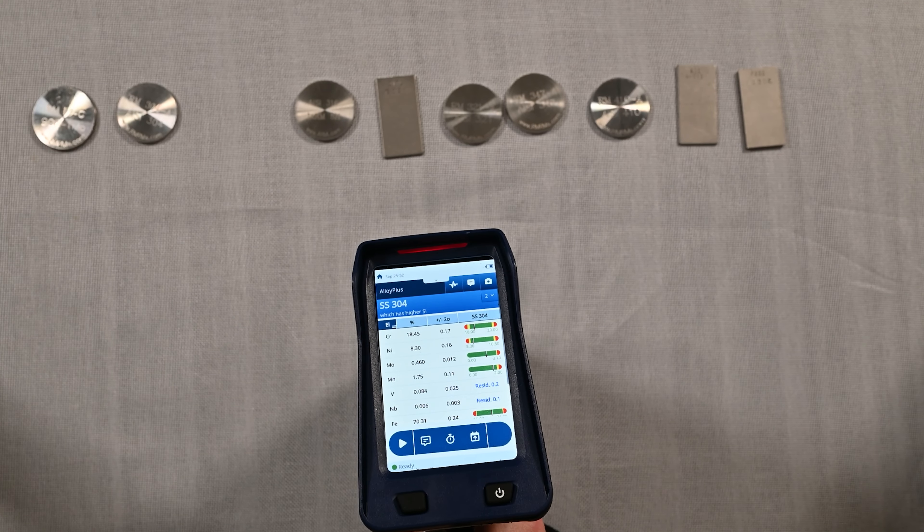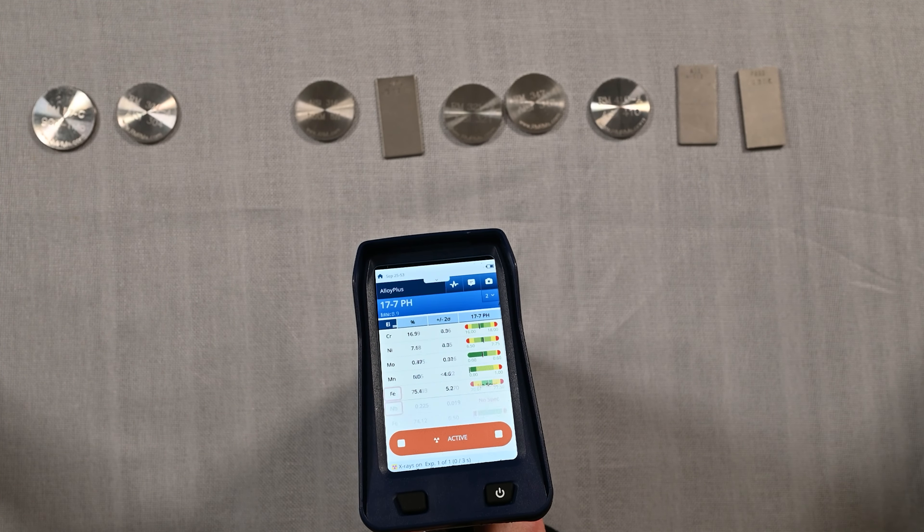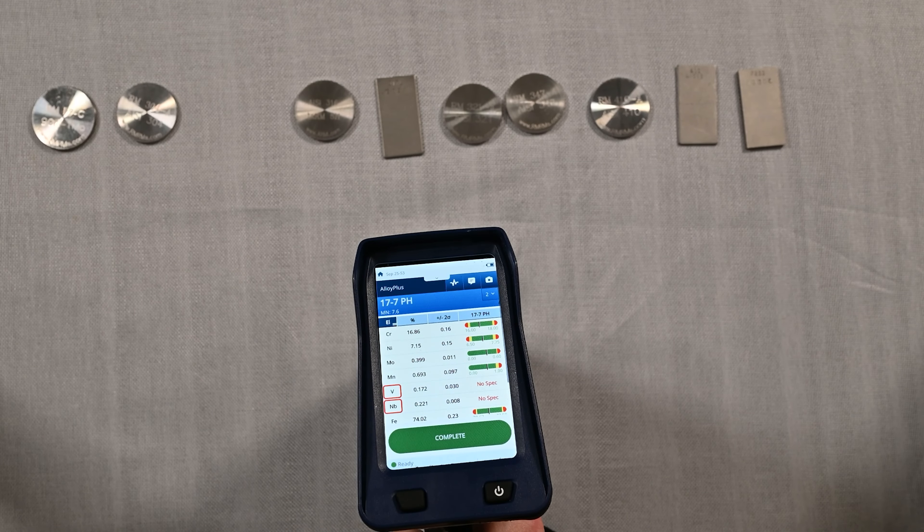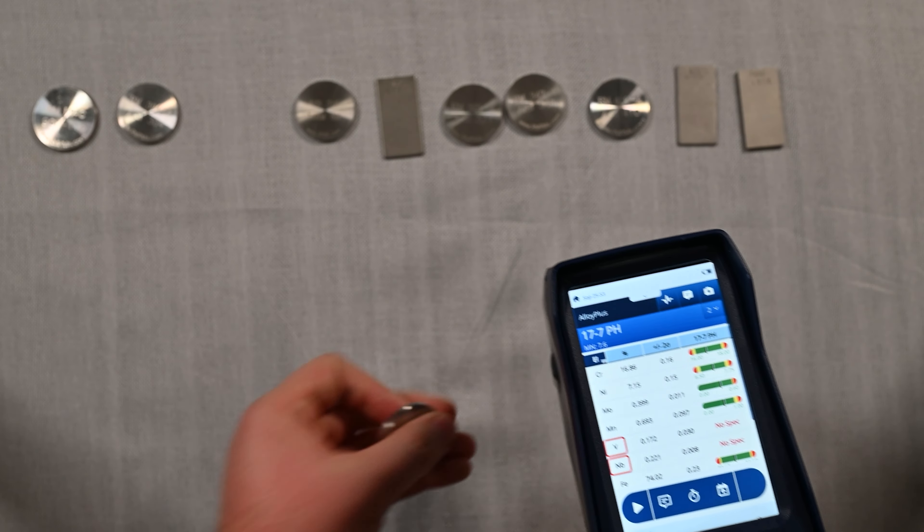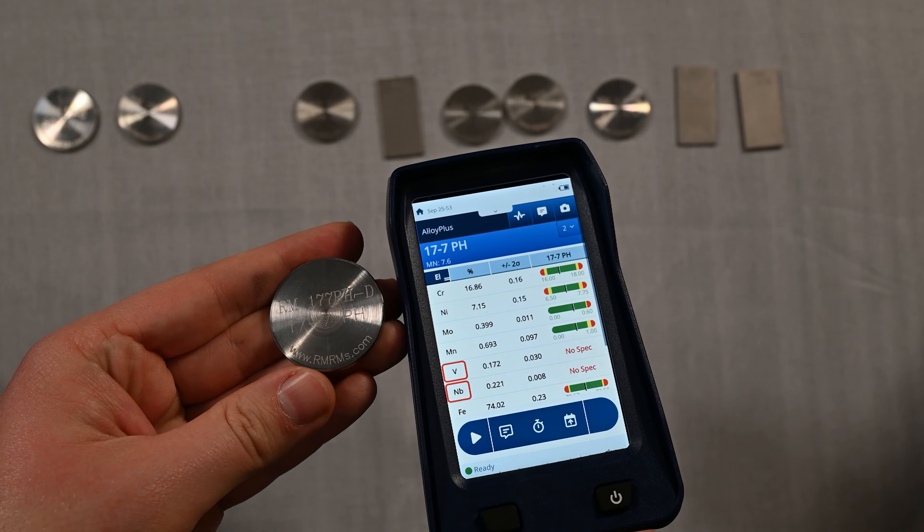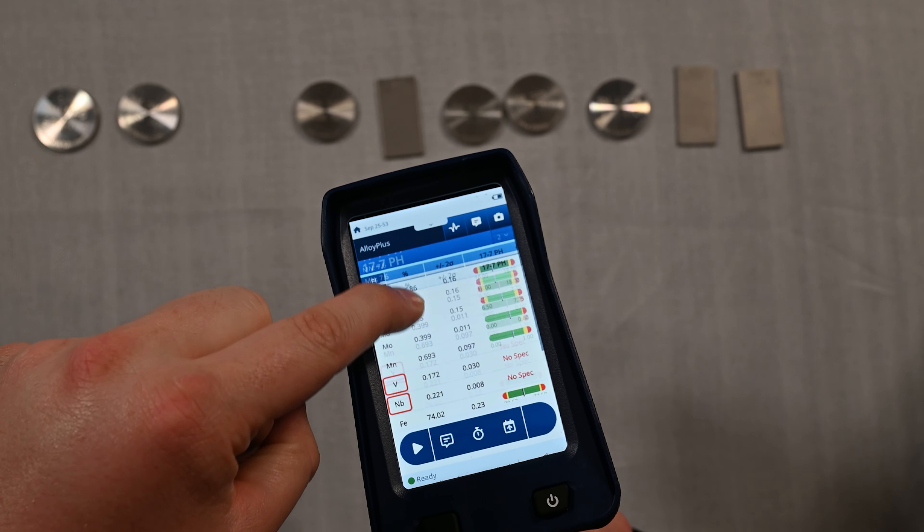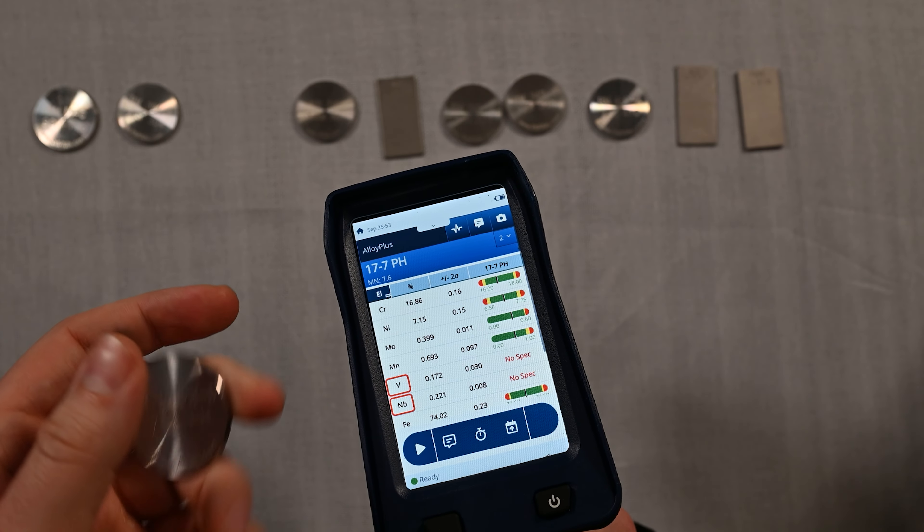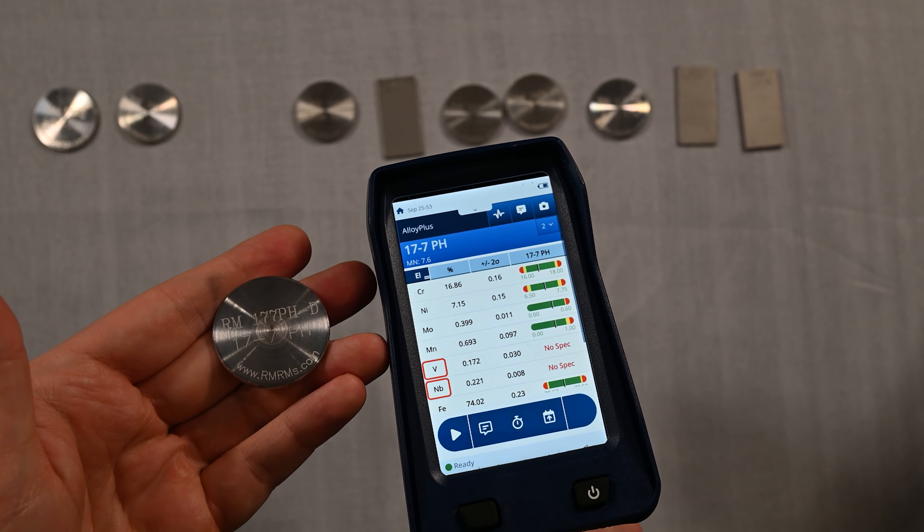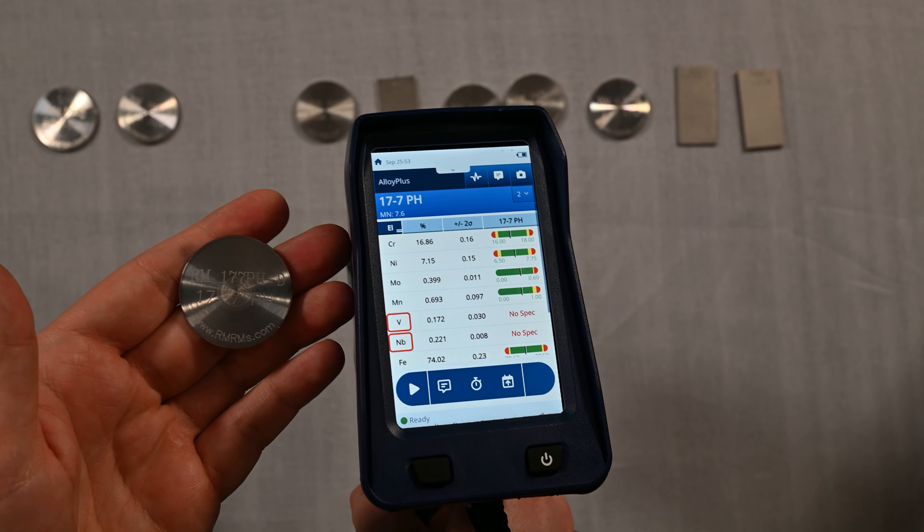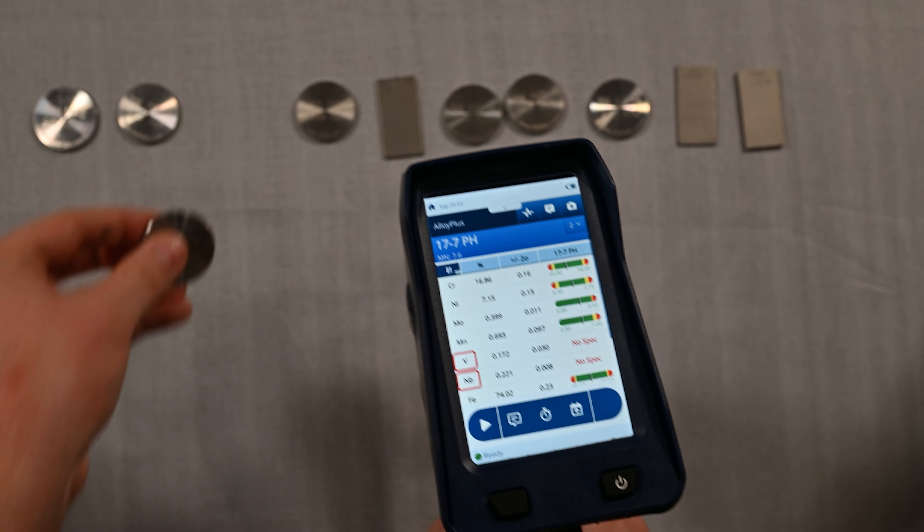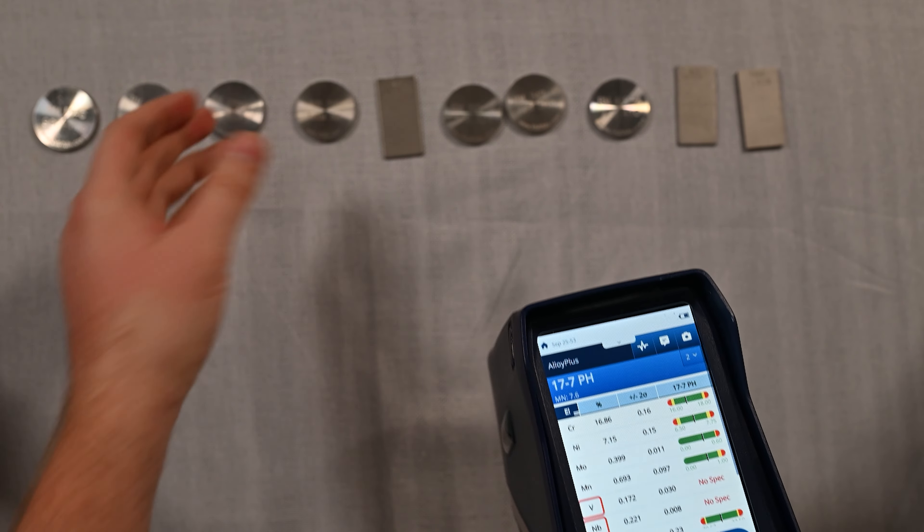Next up we're going right up the list here. This is a 17-7 PH, a precipitation hardened alloy, so we're able to nail this just fine with a great identification. Now 17-7 PH actually has aluminum in it. However, the smart sort can identify without needing to actually see the aluminum. You can turn the smart sort off if you want to identify with that aluminum, but you don't have to. It's an easy alloy to identify with handheld XRF.